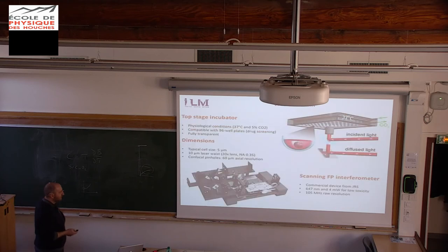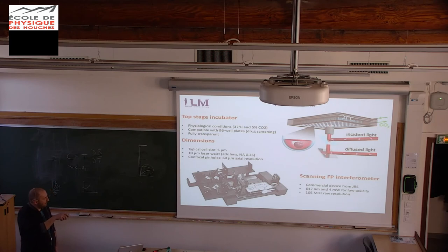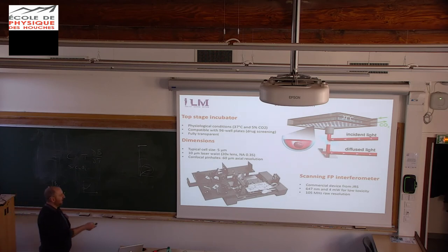So this is what we have done. This is still our measurement. In that case, we use this type of setup. We put our spheroids inside this cuvette, this well. We have many, because biologists like statistics, so we have to do statistics, and it's quite long.